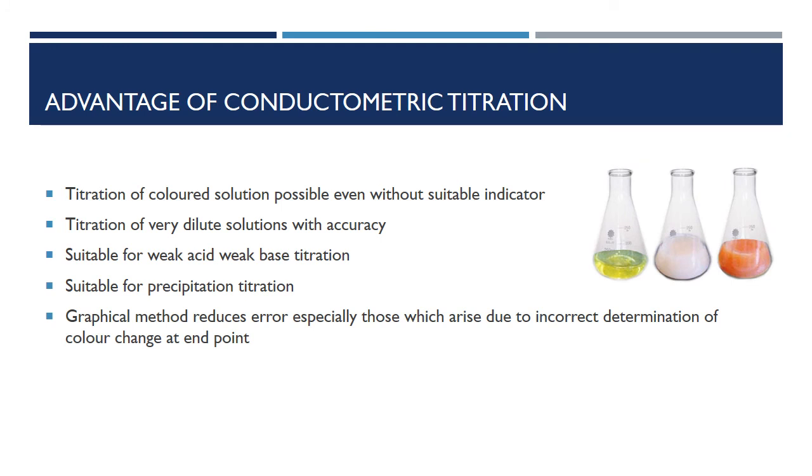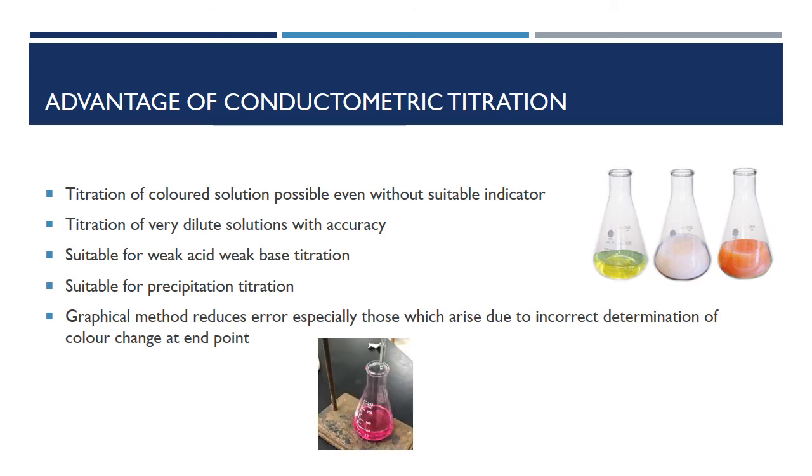The graphical method employed reduces error, especially those which arise due to incorrect determination of the color change at the endpoint.